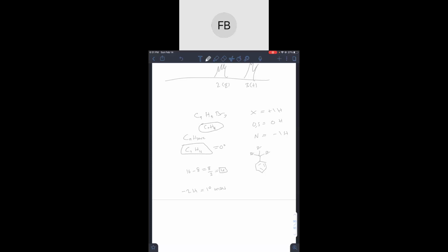All right. So why am I saying all this? Because before you start anything, for more complicated cases, you'll want to go through and do this first. Maybe not later. You get to a point where the cyclohexanes are familiar, but maybe you want to double check after you're done so you're not wasting time. But for now, whenever you see a more complicated carbon structure, you're first going to figure out the general shape and write that shape down.